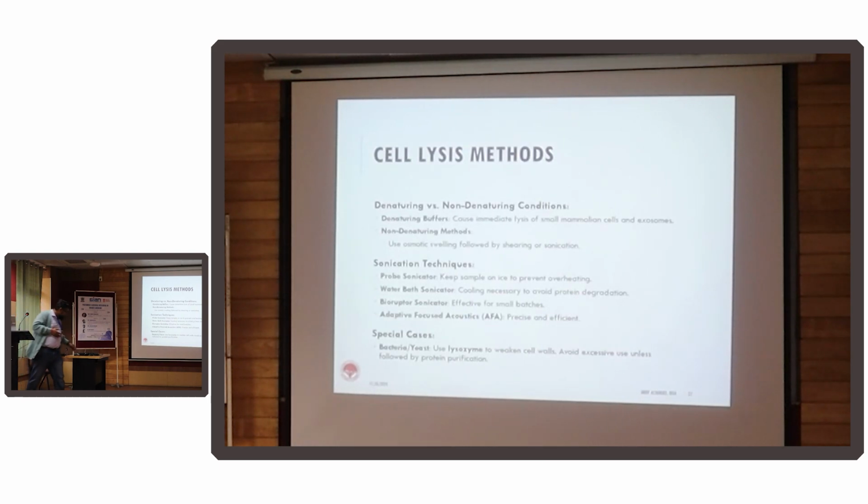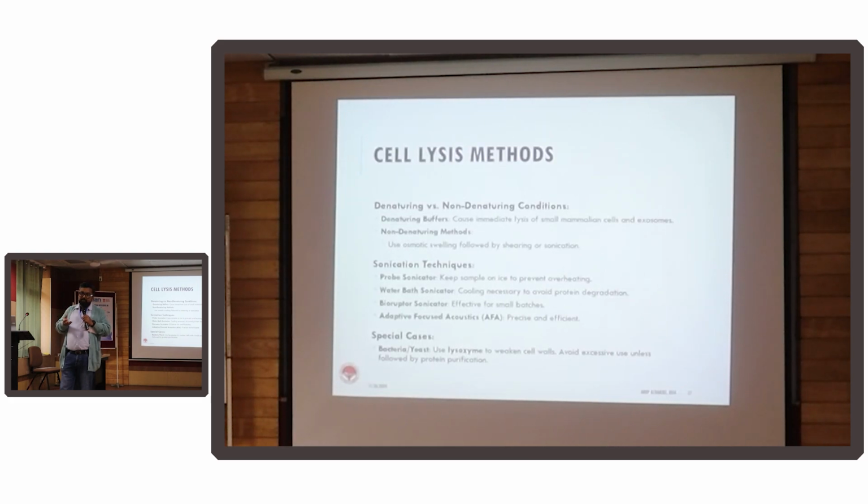Suppose you have lots of lysozyme. You have added a foreign protein into your system. You're working with a bacterial pellet, and to that bacterial pellet you have added lots of lysozyme. What would the biggest disadvantage be when you're running it on a mass spec? It will degrade the protein that we are working on. What else?